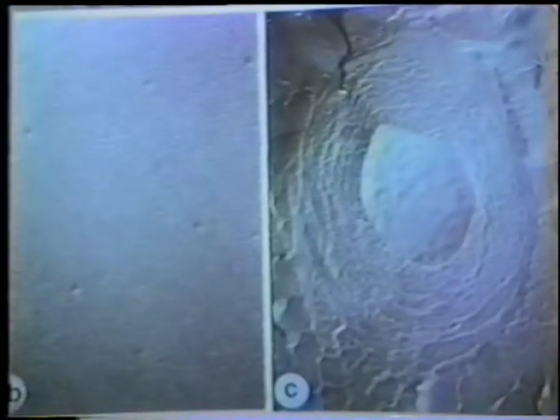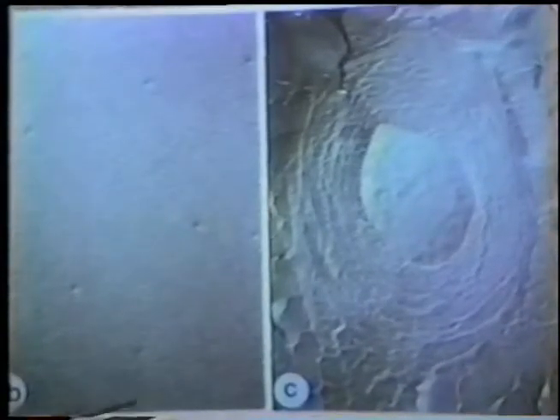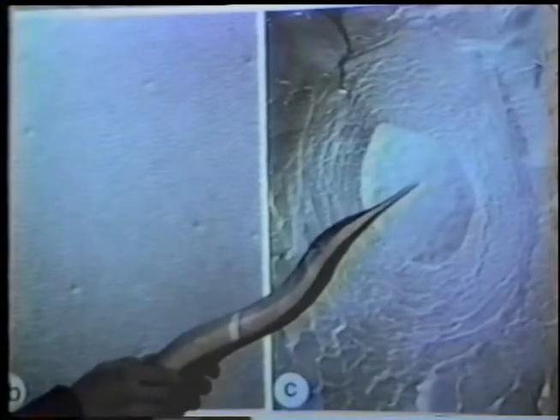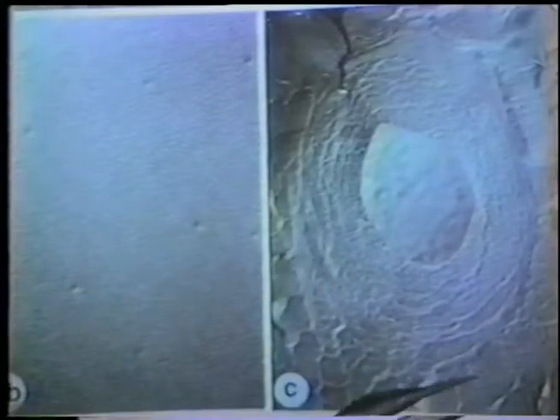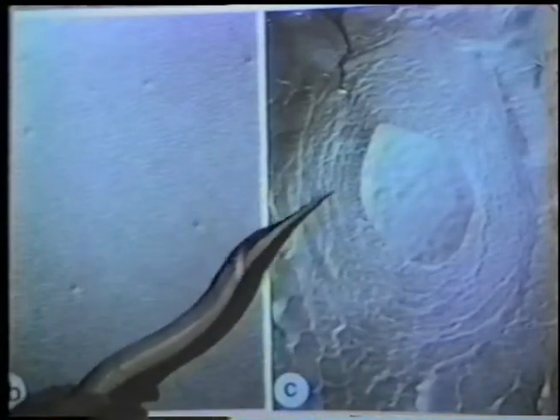Now, freeze fracture is not the most sensitive method for detecting ice crystal damage, but it is fairly sensitive. And if freezing is not optimal, what one sees is lumpy membranes and ice crystal damage in the extracellular medium. Here you can see smooth domains of ice surrounded by domains of eutectic, the raised ridges. The sample was slightly etched.